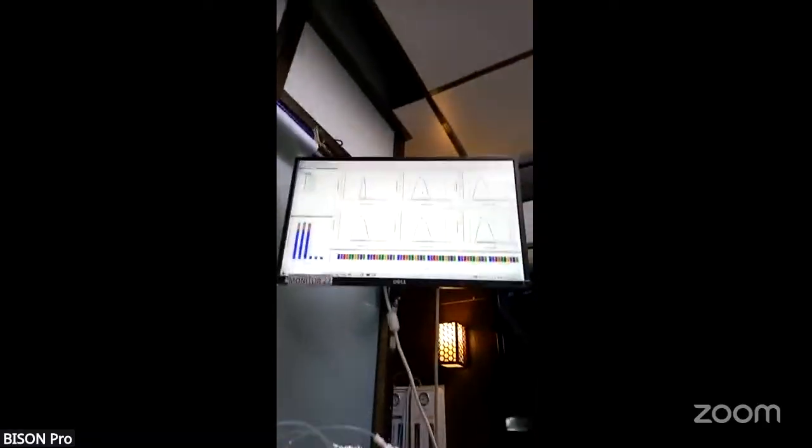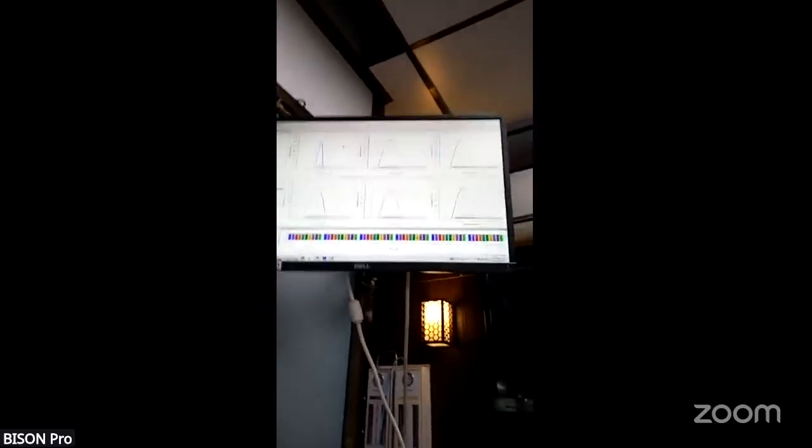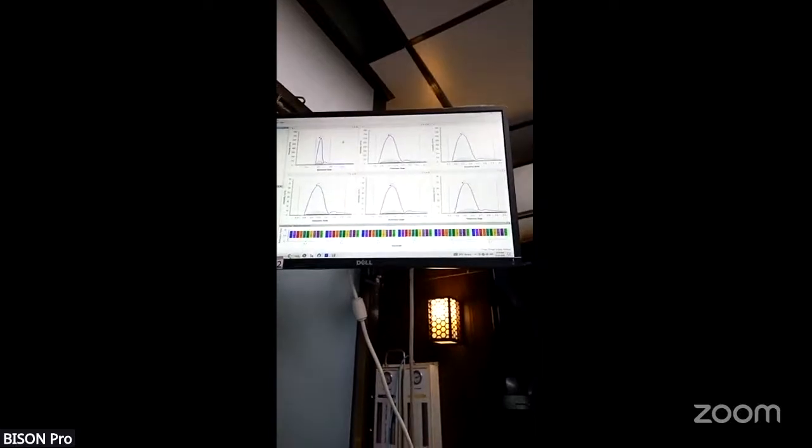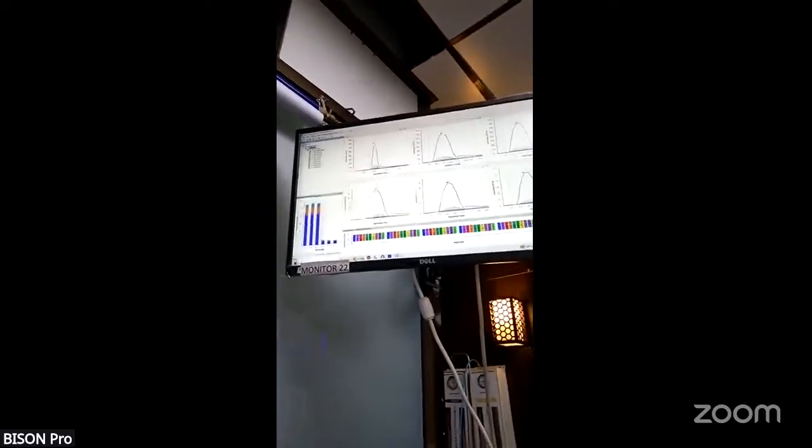So this is how the chromatogram of the acquisition looks. These are each of the transitions. You can see, in our routine quality check, this is the reserpine data. Generally, these are the reserpine quality control checks which have been done. See, these are the transitions.